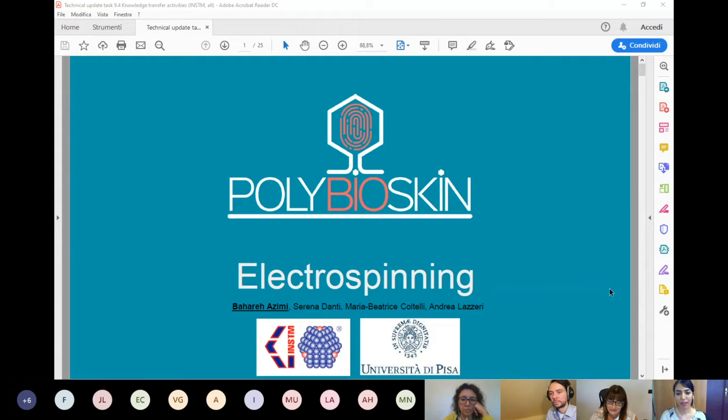Hello everybody. As Beatrice explained, I'm going to talk about electrospinning, which is the most common method to produce ultrafine fiber. We also use this technology in the POLYBIOSKIN project to produce fibers and also to modify some substrates, which I am going to talk about in the next slides.